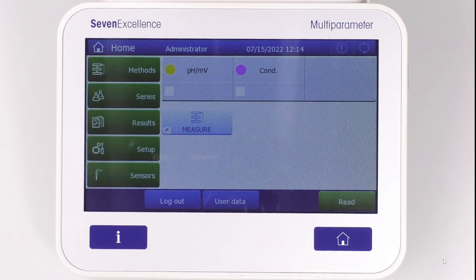This way of starting the analysis is mainly used by users with operator rights. Remember that you have to have administrator, expert, or technician rights on the meter to be able to set the shortcut.